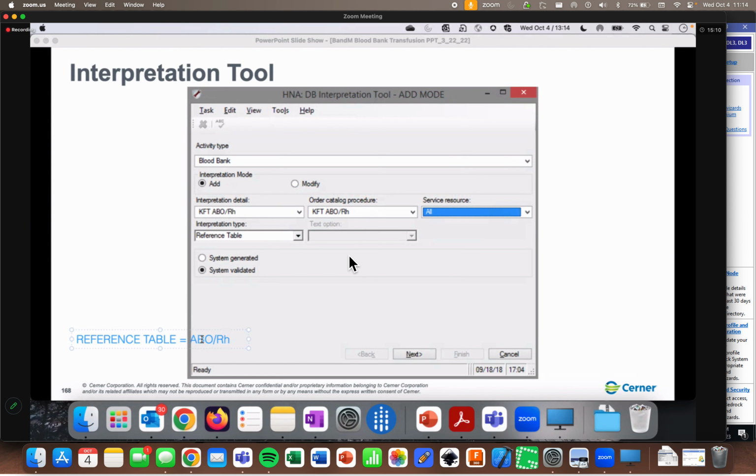The ABORH values actually live on a separate table. Unsurprisingly, it's called the ABORH table. Why they're built out on their own table instead of a code set? Probably because of the way they used to have to be barcoded with CODEBAR. So, fact of the matter is, they exist separately in the database.